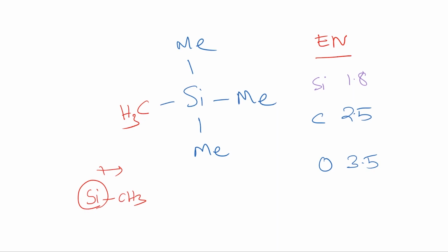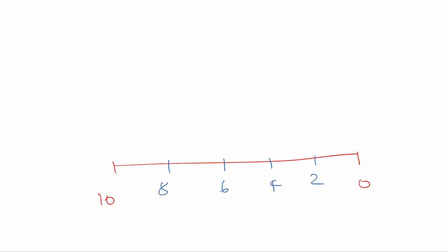Okay. Now, what happens is that we assign the frequency at which this tetramethylsilane operates, that chemical shift, as 0. Okay. So, once you assign that as 0, then the rest of the spectrum becomes easy to determine. Okay. So, this is how a typical proton NMR spectrum is going to look like: 2, 4, 6, 8 and 10. Okay. So, now you will see here that the proton NMR spectrum typically is in the range between 0 and 12, whereas the carbon is between 0 and 200. So, we will get to that again later.